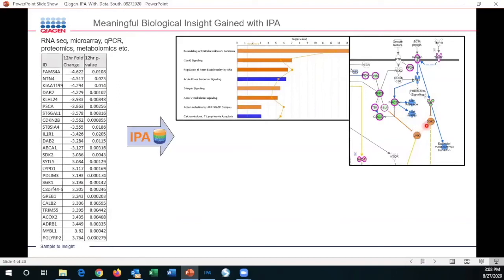And so you'll see on this network other nodes with orange and blue molecules, and these represent the predicted individual molecular changes in the pathway itself. So we can get an assessment of what pathways are important, overall how they're changing, and then how our observed gene changes or protein changes in that pathway can influence other molecules in that particular pathway.